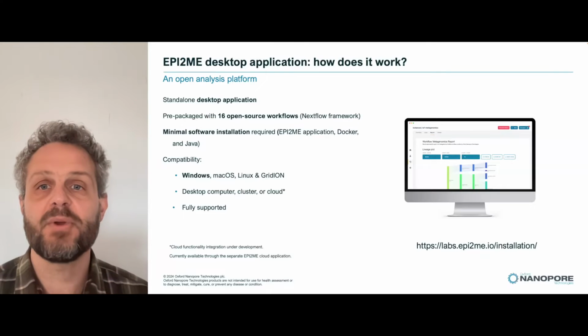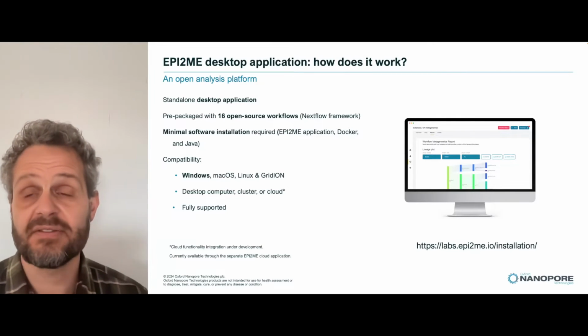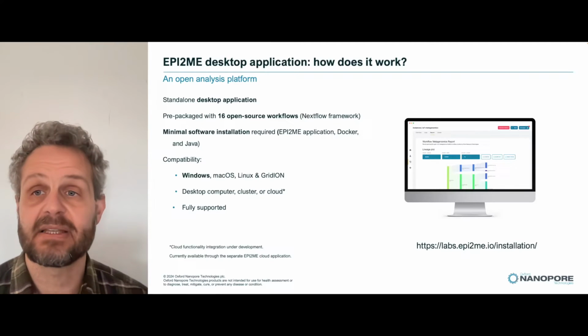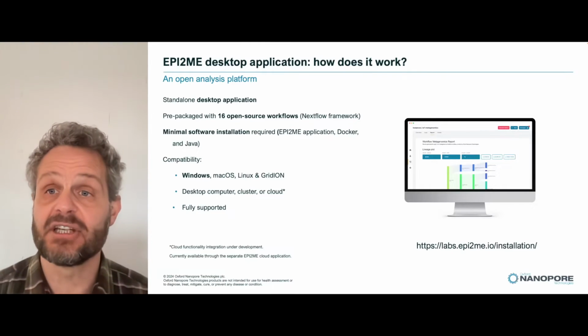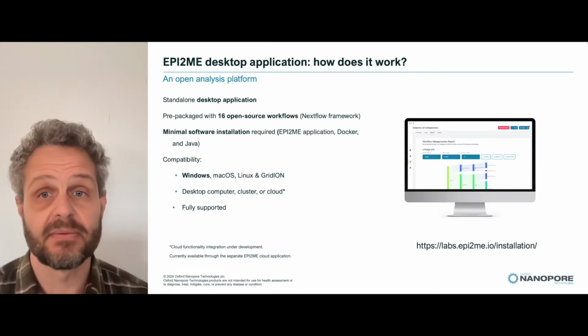So wf-single-cell is part of the EPI2ME platform, which is developed here at Oxford Nanopore. It includes a collection of bioinformatics workflows geared towards ONT data and a desktop application for managing and running those workflows both locally and in the cloud.